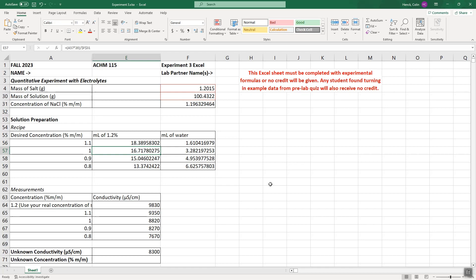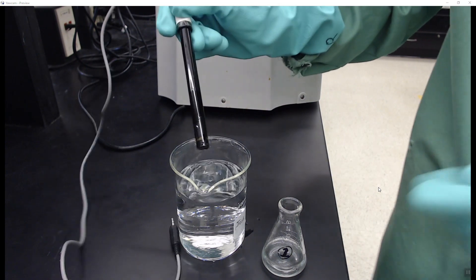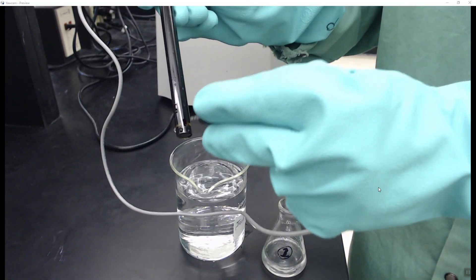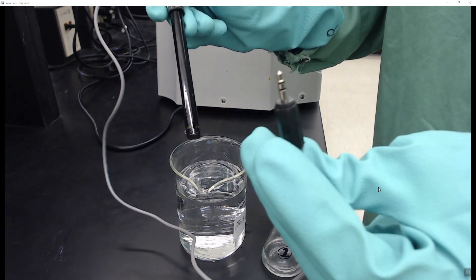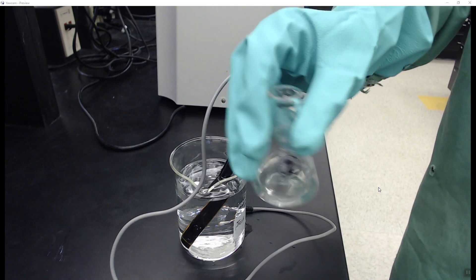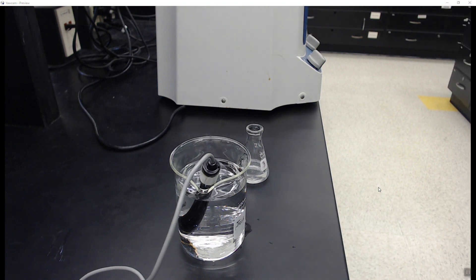Here in the lab I have a large beaker of water to rinse the conductivity probe. The conductivity probe has a small hole where solution enters for analysis — make sure your solution level is above it. It uses a headphone jack connector, not an Ethernet cable (that would be a thermistor). I have a 1% solution ready. Plug the conductivity probe into the MicroLab port labeled 'Conductance,' then start the MicroLab software.